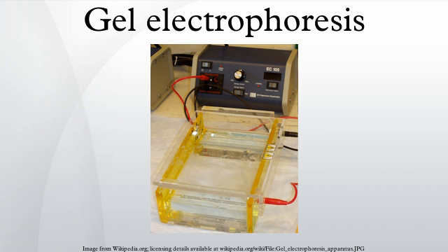Types of gel. The types of gel most typically used are agarose and polyacrylamide gels. Each type of gel is well suited to different types and sizes of analyte. Polyacrylamide gels are usually used for proteins, and have very high resolving power for small fragments of DNA. Agarose gels on the other hand have lower resolving power for DNA but have greater range of separation, and are therefore used for DNA fragments of usually 50 to 20,000 bp in size, but resolution of over 6 megabases is possible with pulsed field gel electrophoresis.